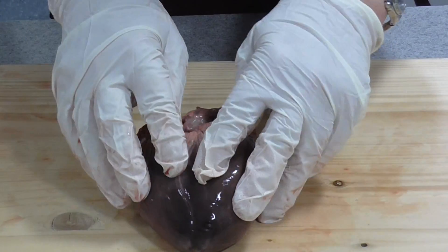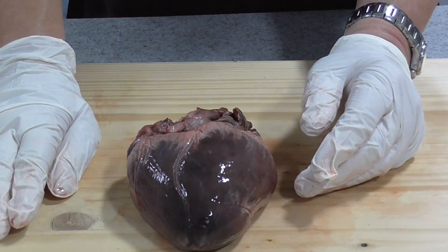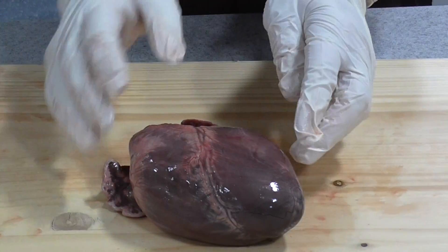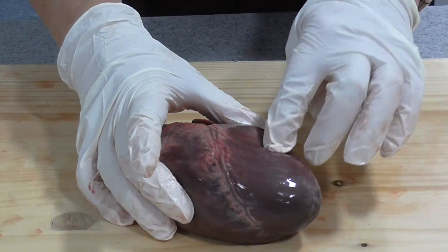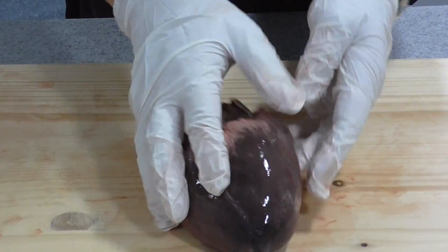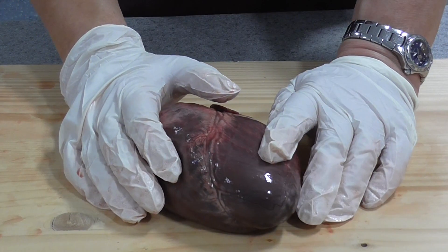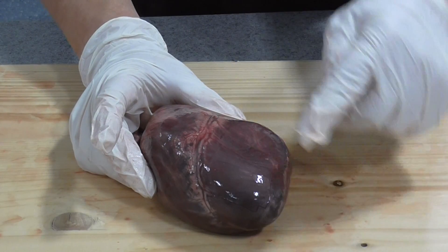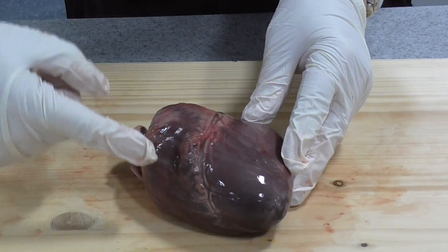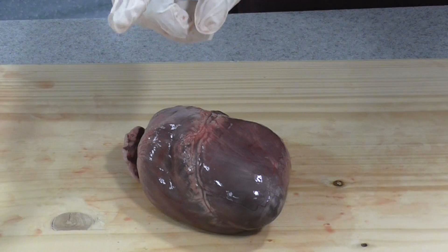When you start dissecting, the first thing you have to do is locate the right ventricle. Your ventricles are one each side of the line that runs along the septum. The way to do this is to poke the heart with your finger. You should know from your biology lessons that the wall of the left ventricle is much thicker and more muscular than the wall of the right ventricle. The left ventricle offers a lot of resistance when you poke it, whereas the right ventricle wall is much more flexible and not as thick.